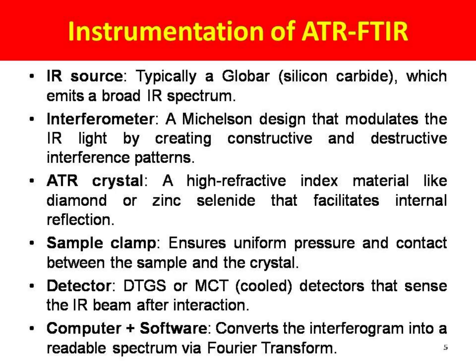The detector used in ATR FTIR: DTGS or MCT detectors that sense the IR beam after interaction. Then the software converts the interferogram into a readable spectrum via Fourier transform.